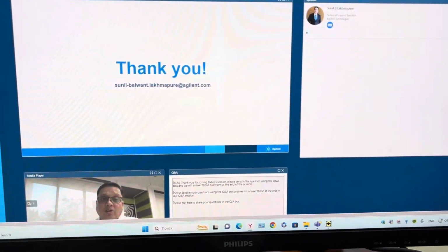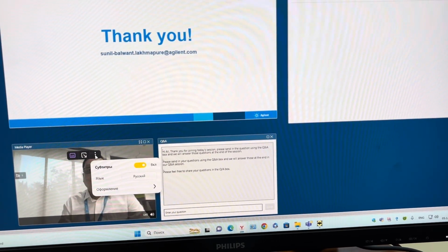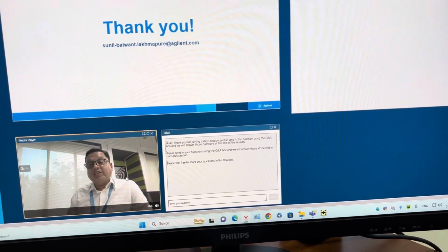So to avoid this, the septa are stuck to the caps. They are known as bonded septa. Please be aware, this is a very small thing to observe, but if you use a bonded septa and pre-slit for HPLC, definitely you can minimize the incidents happening because of the septa or the cap. So that is a bonded septa.